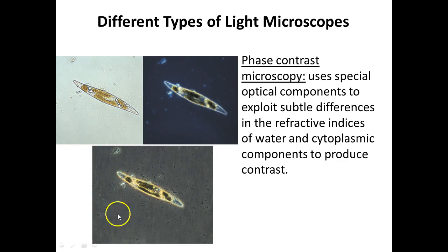You can actually see all the little guys outside of this euglena, right? Where they just look like dirt on these slides. These are actually little tiny organisms, right, outside of this euglena.